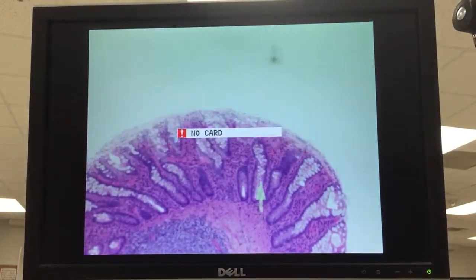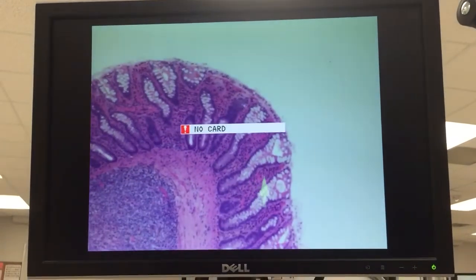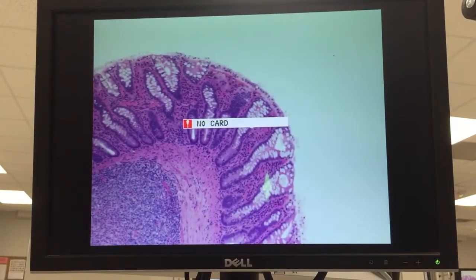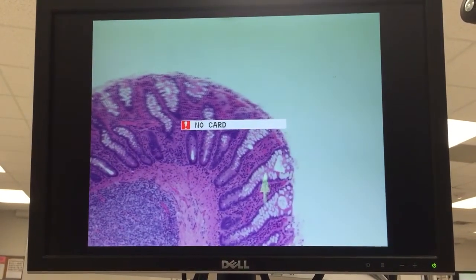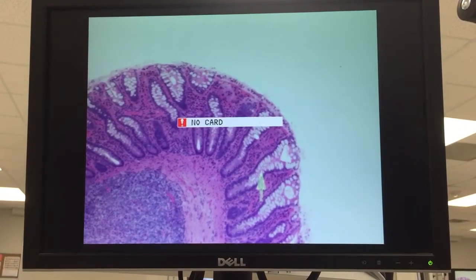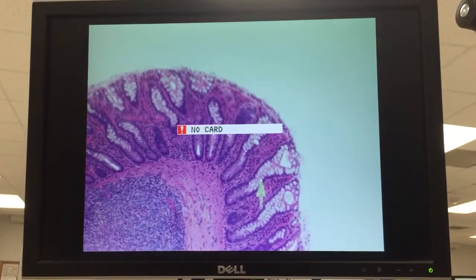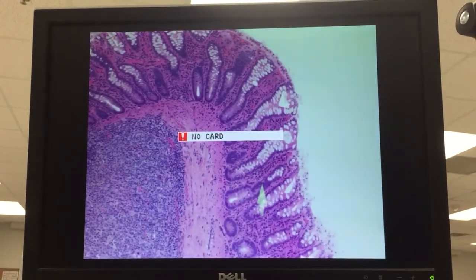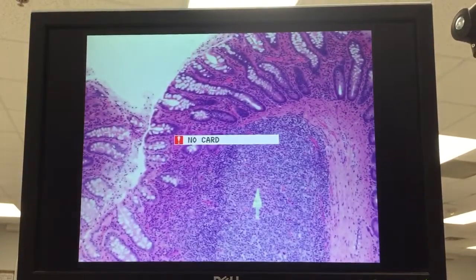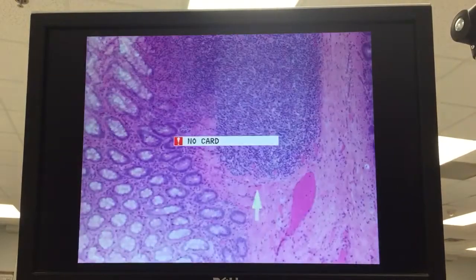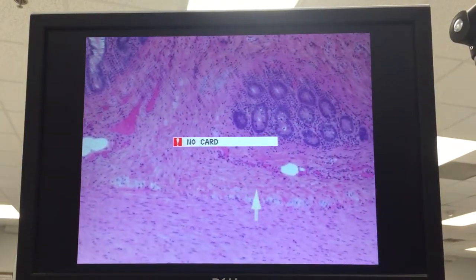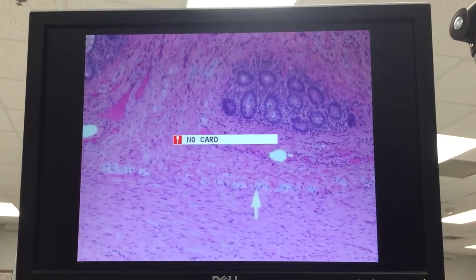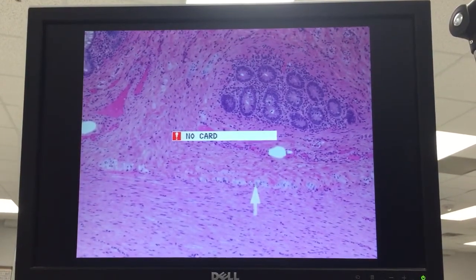So as we look at this, that's not a villus — that's the lamina propria. Here's the crypt of Lieberkühn. So we have invaginations with no evaginations. We still have a muscularis mucosa. We have a lymphatic nodule here. Submucosa. And here is the submucosal plexus right there.